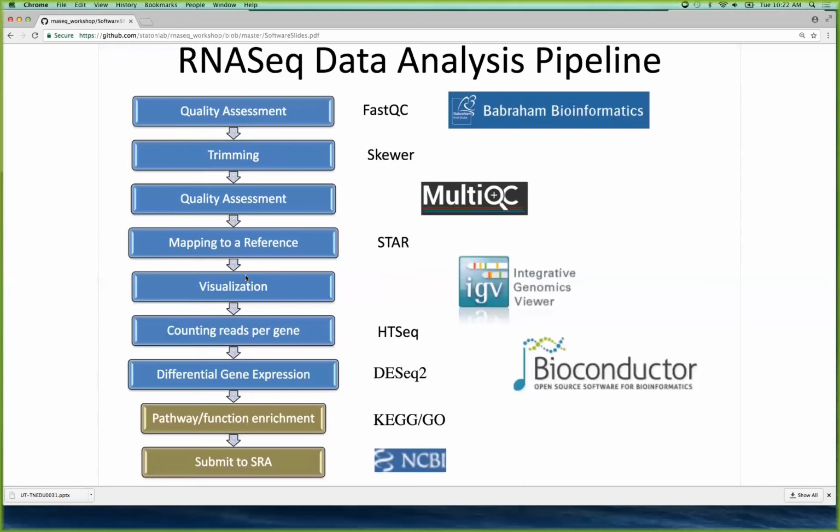Okay, so here I'm going to explain how the RNA-seq analysis looks like. The usual RNA-seq pipeline looks like this. You have a first quality control step of the reads that come out of the sequencer. We're going to use FastQC, this software. Then you have to trim the adapters that Meg was saying before. Going forward, you can also do some other quality trimming steps that I'm going to say later.